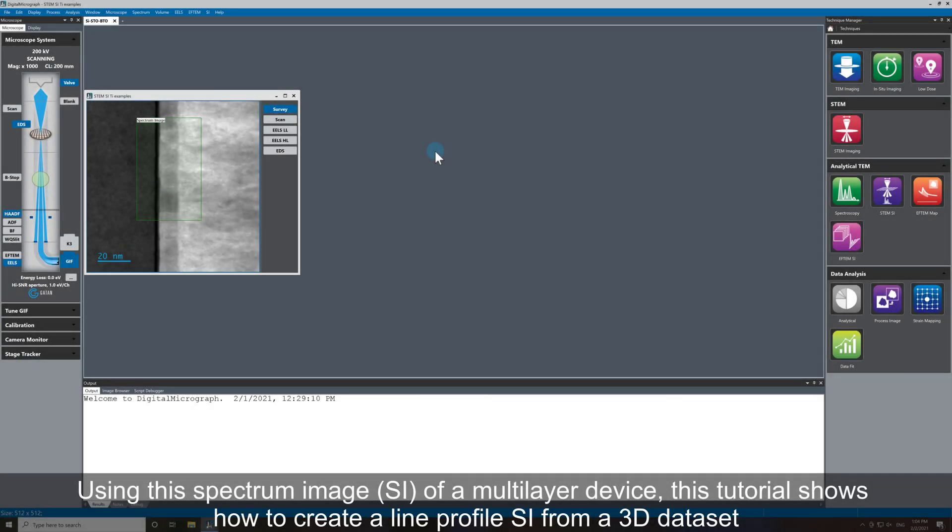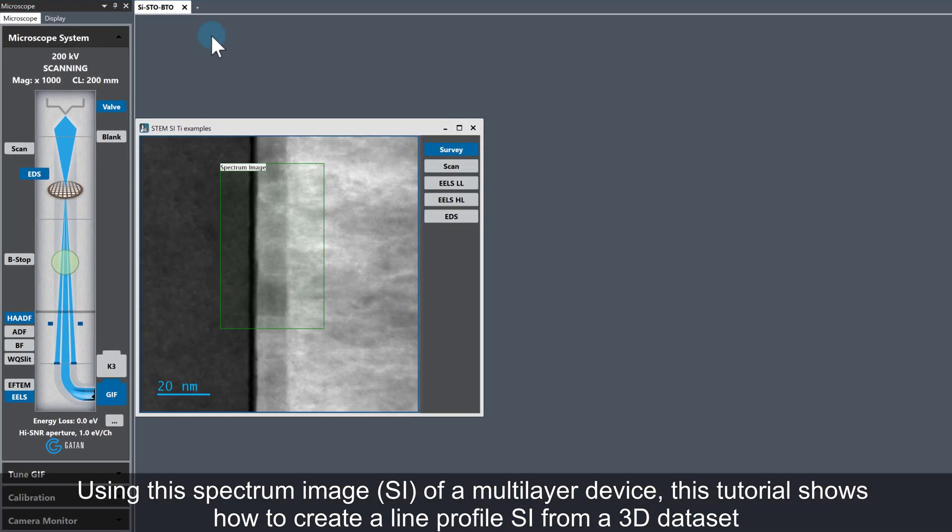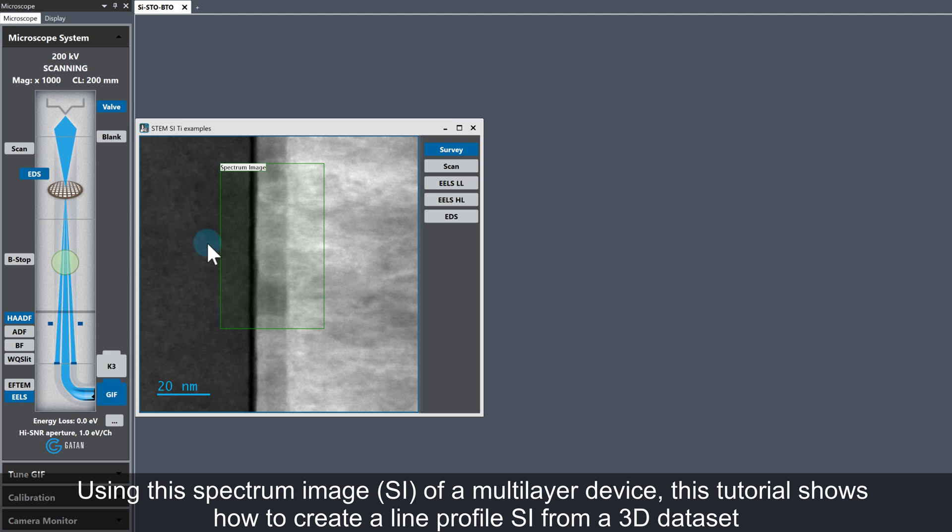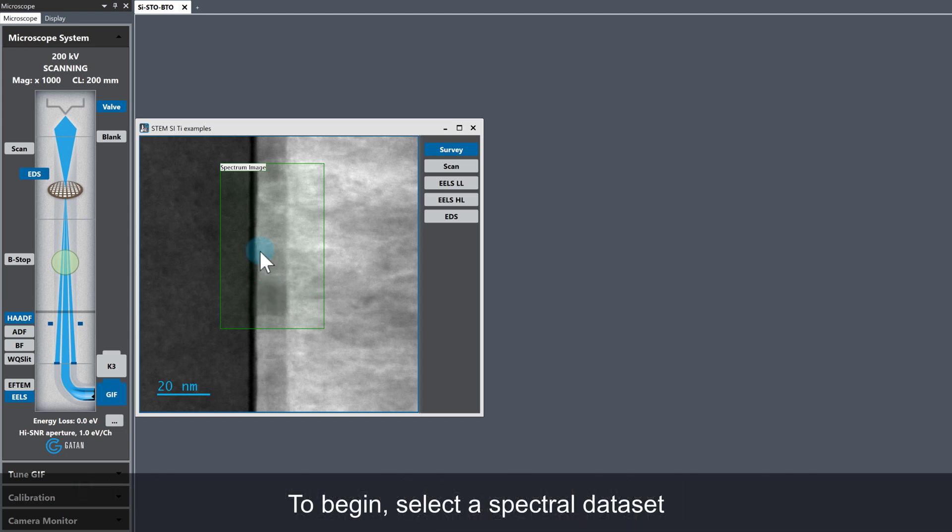We're looking at a spectrum image of a multi-layer device with a silicon substrate, a strontium titanate layer, and a barium titanate layer. This tutorial shows how to go from a 3D dataset (a 2D array) to a line profile SI.